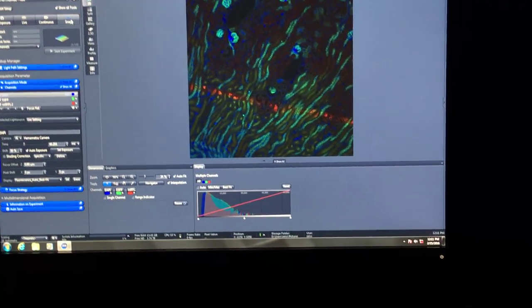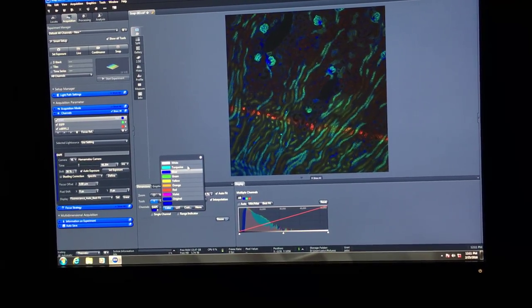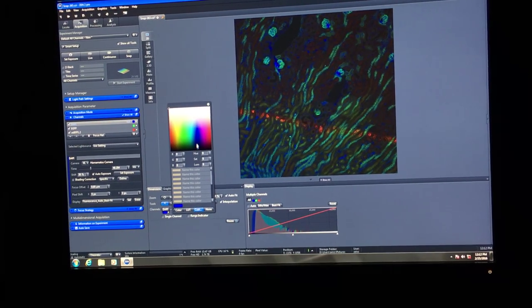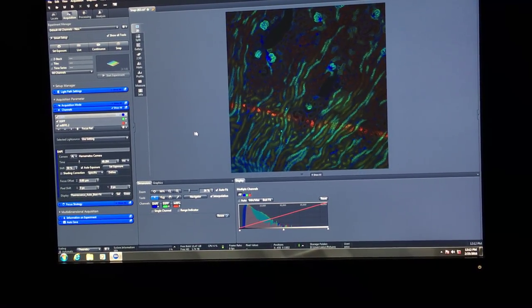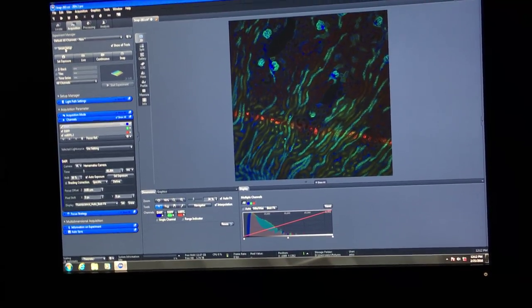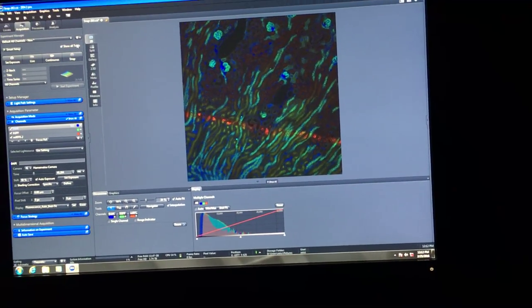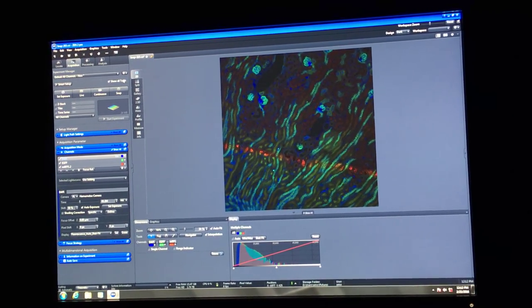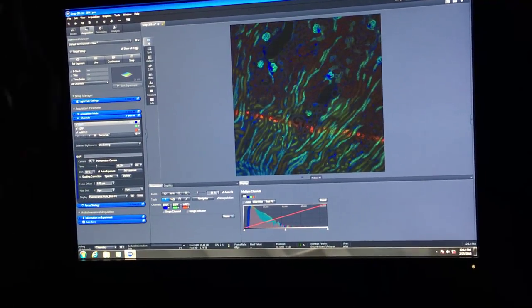If you change your mind about the color later, you can go in and change it to turquoise or open a custom palette. Auto exposure is for people who don't care about exact exposure time and aren't doing quantitative studies—it automatically selects an exposure time based on the intensity of the dyes for different samples.